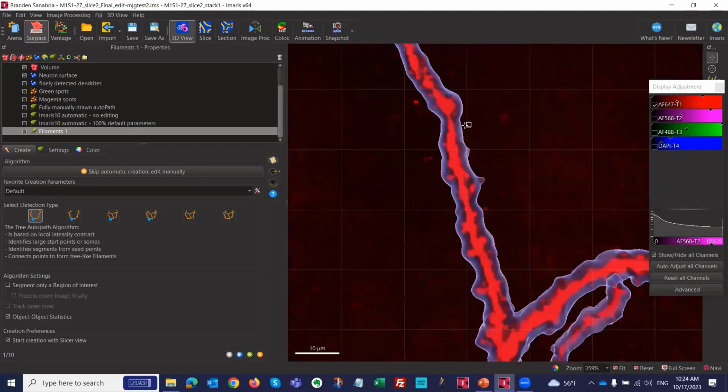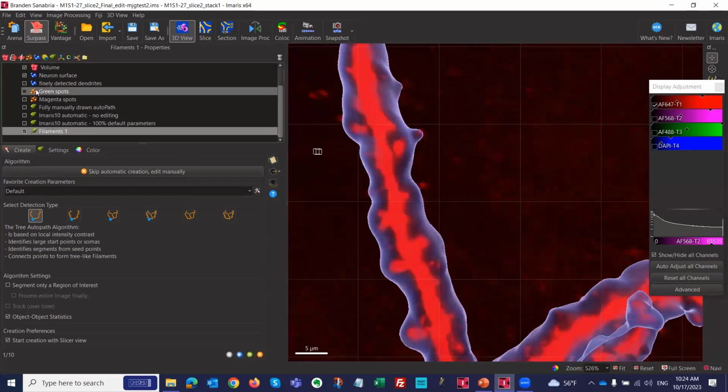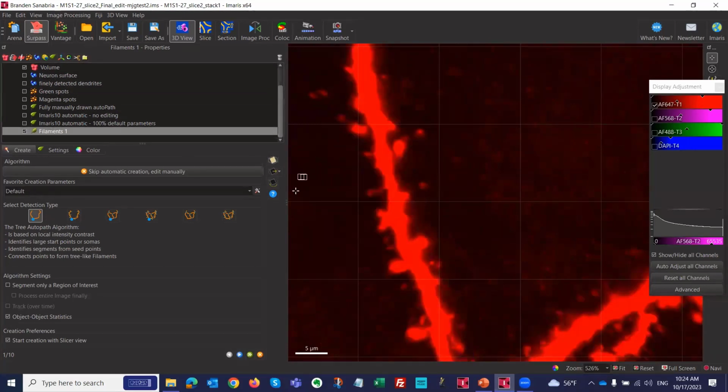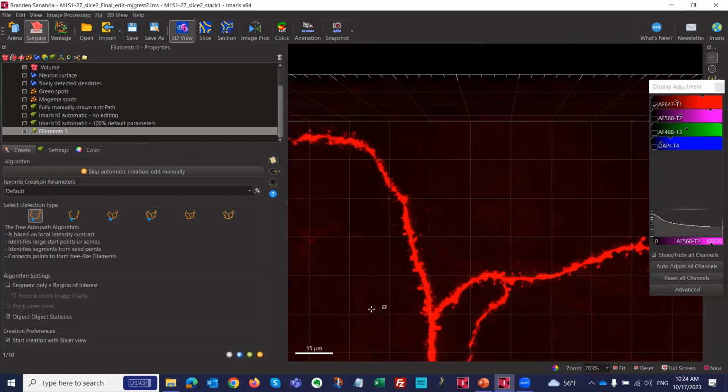And then the other 2 here, those are for vasculature, for example, or sometimes you have a high zoom in here and you want to do a spine analysis and you only look at the branch and there's no soma, then you will also use this guy here. So we have with spines, without spines, interconnection, no connection, no loops, those kind of things. So I can do a spine analysis here. You can see this, it's possible. I would recommend a higher magnification for accurate spine analysis than this, but again, it is possible doing it here.